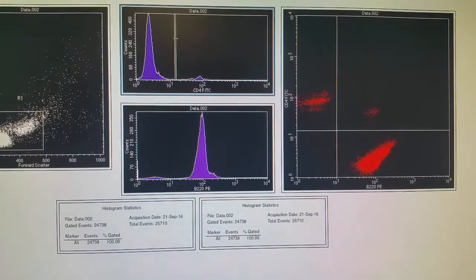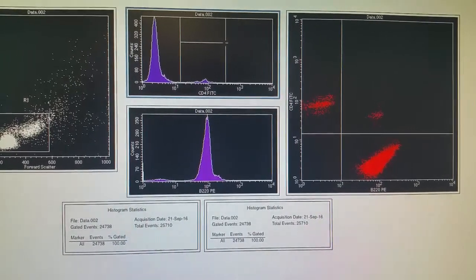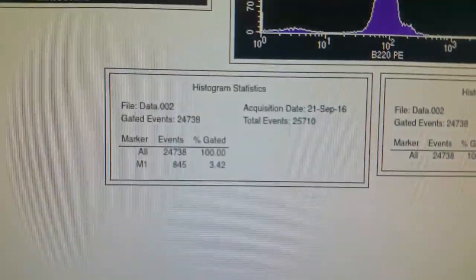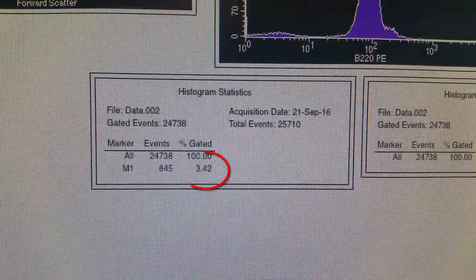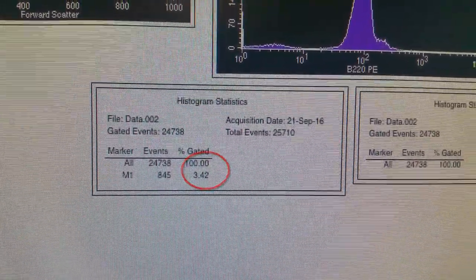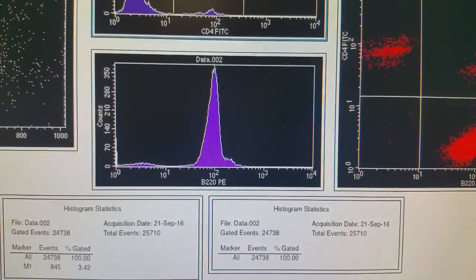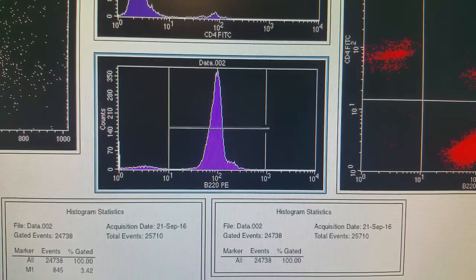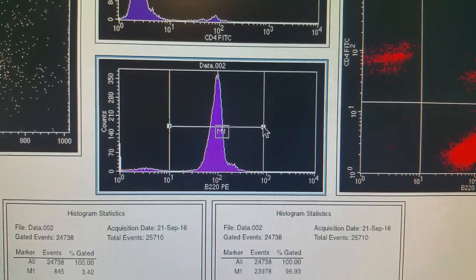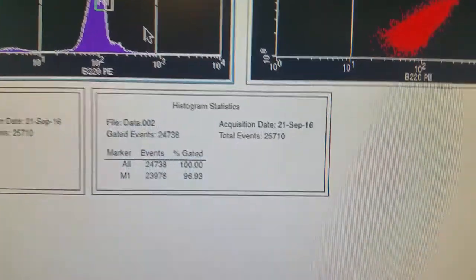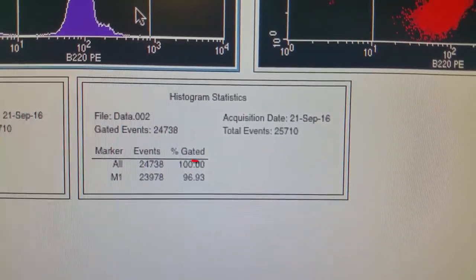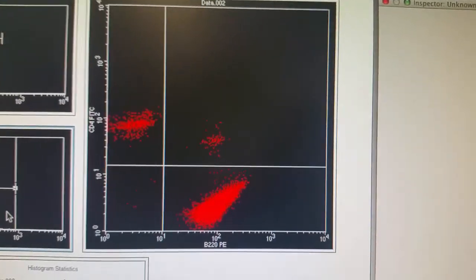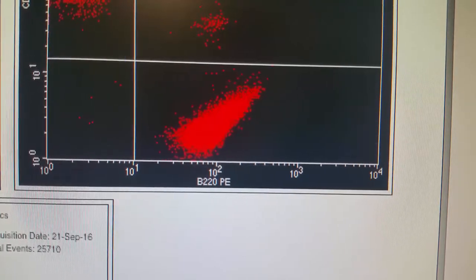What we can do now is get statistics. I'm going to take a marker and place it surrounding the positive cells for CD4. Looking at the histogram statistics for M1, it shows that 3.42% of the cells are positive for CD4 — so about 3.5% of the cells in my sample are CD4 T cells. I'm going to do the same thing for our B cells. The marker shows the cells that are positive for B220, and when I look at the histogram statistics, I can see that 96.93% of cells are positive for B220 — so about 97% of the cells are B220 positive.